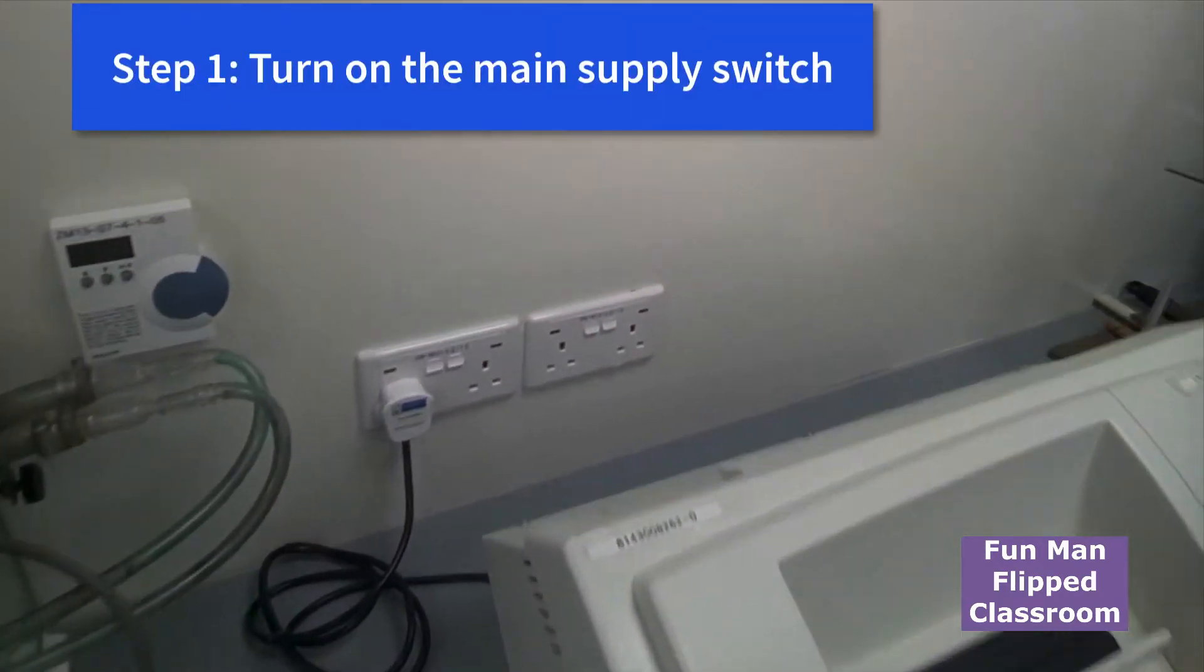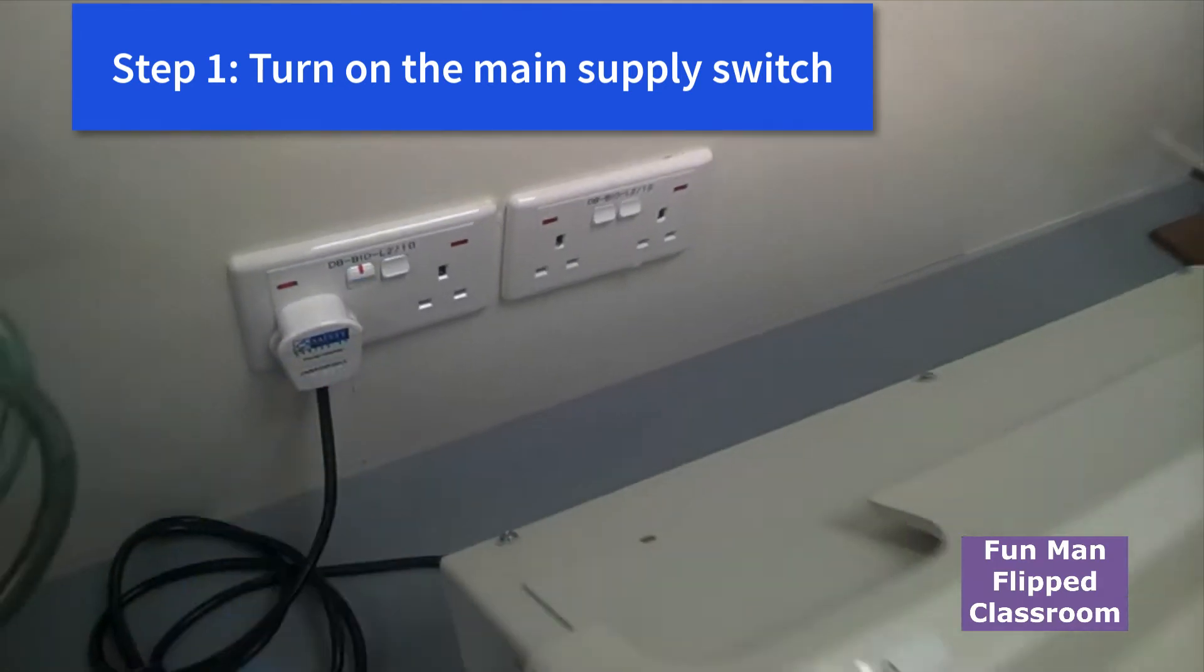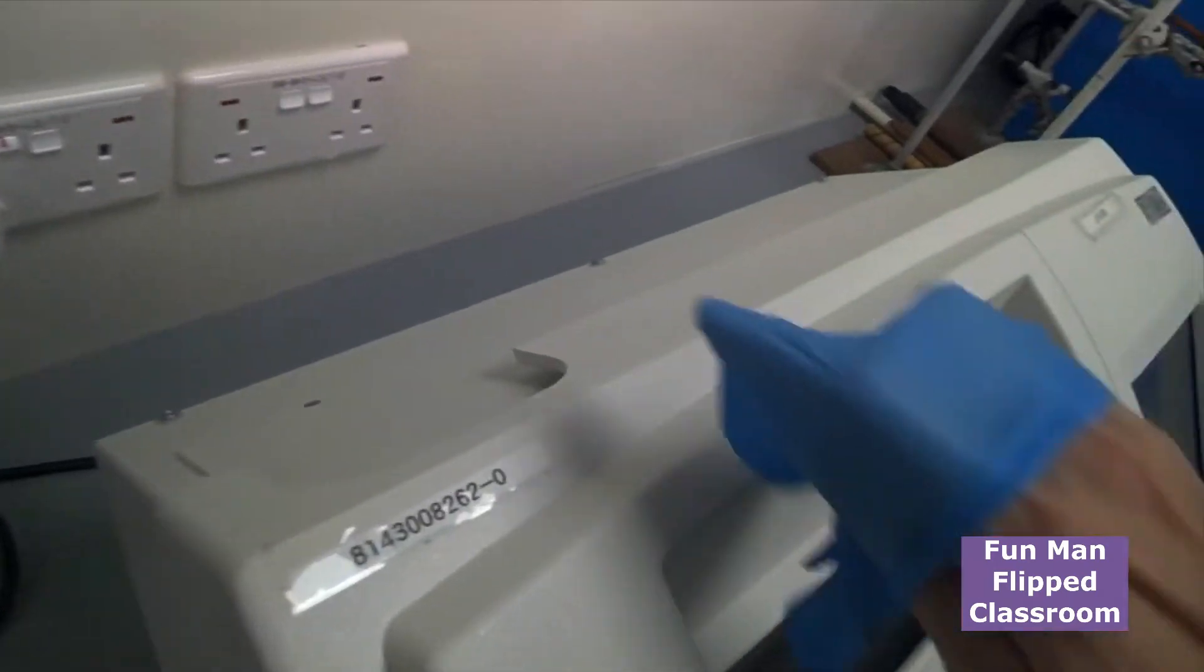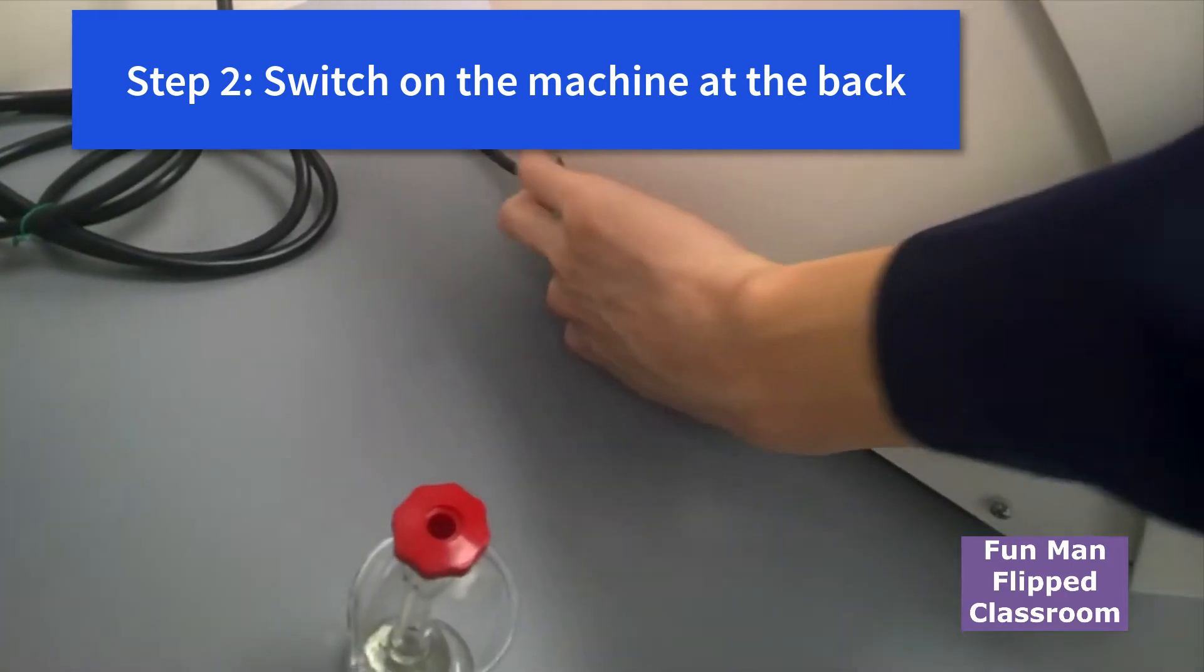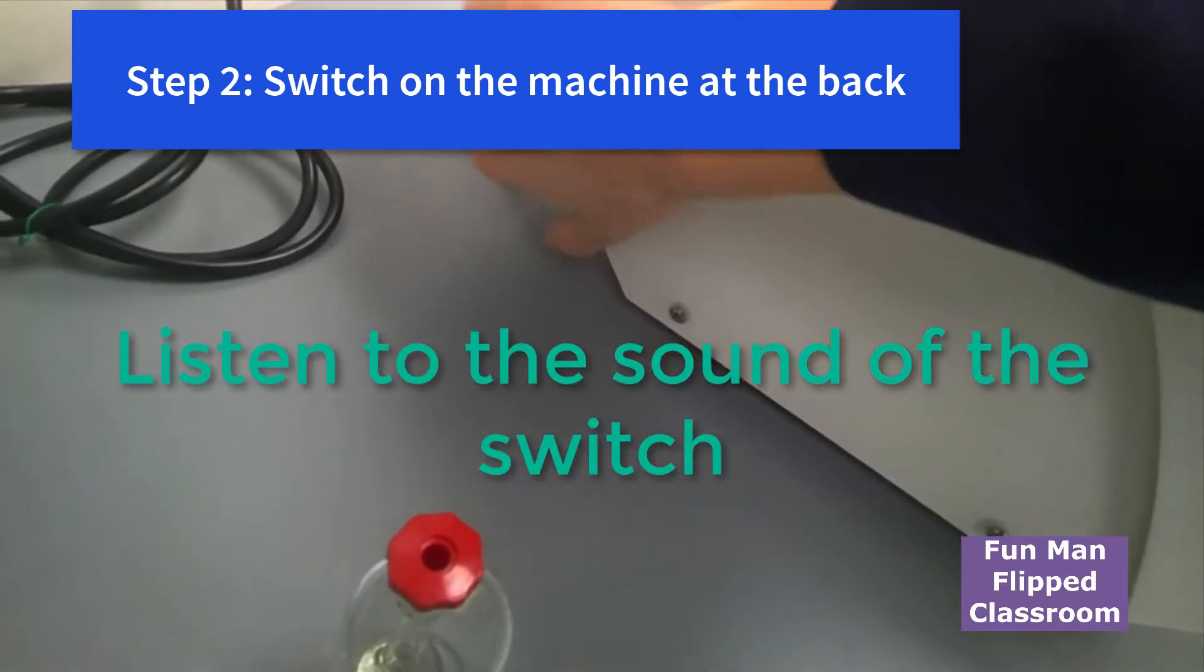Now the first thing you do is you turn on the main supply switch. The main switch for this apparatus is at the back. See, through the wire at the back, I would not turn it because I would like it to be stable. But at the back, you've got to flip it and switch it on.